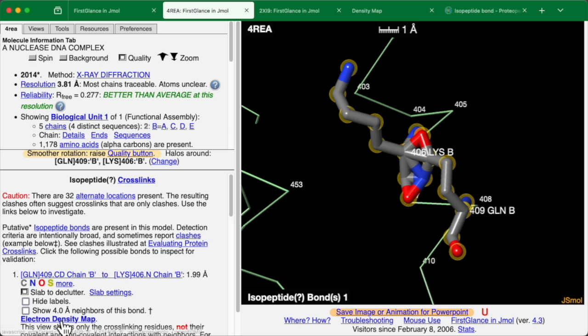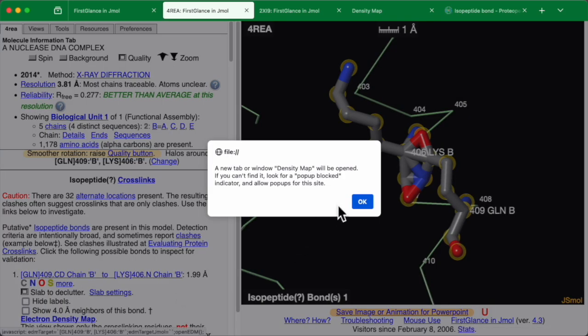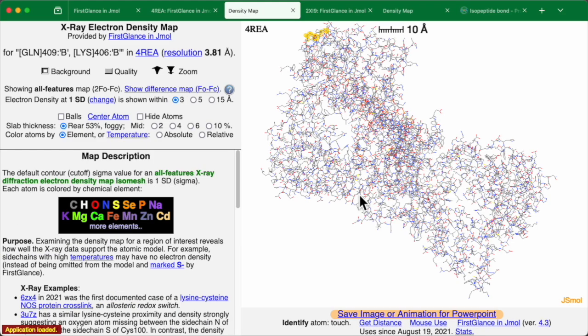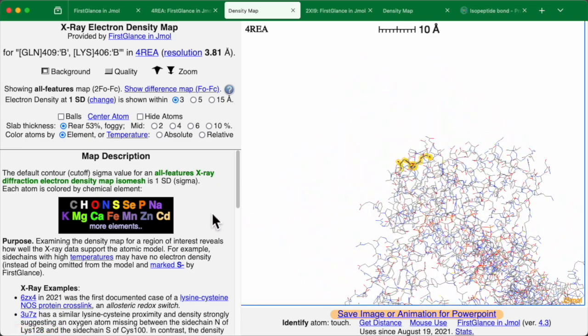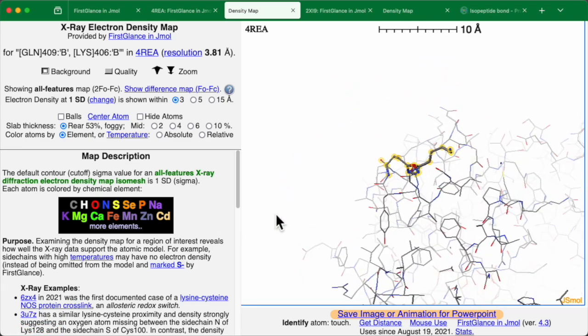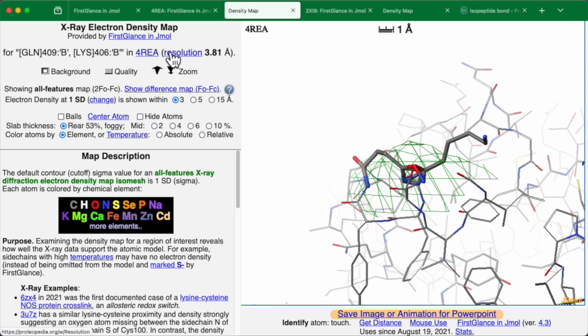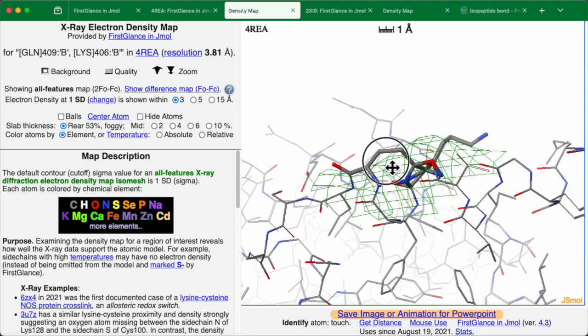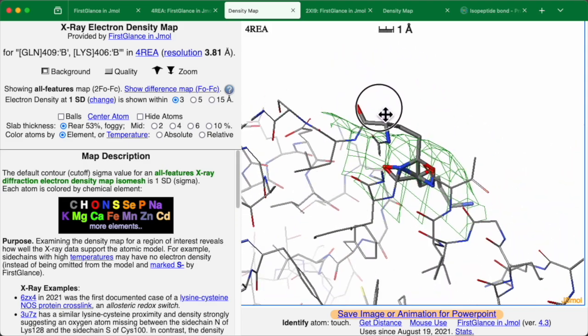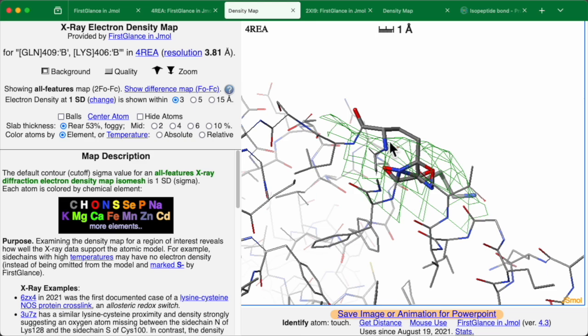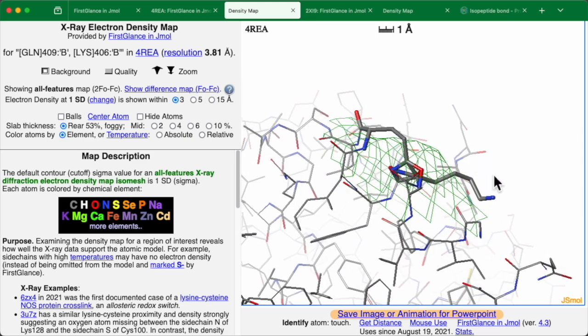Let's look at the electron density map. Notice the resolution here is far worse than our other example. Here it's 3.8 angstroms, which is far worse than 1.9 angstroms. And we see that the map here doesn't fit the model well at all. We see parts of the model sticking outside the map here and here.